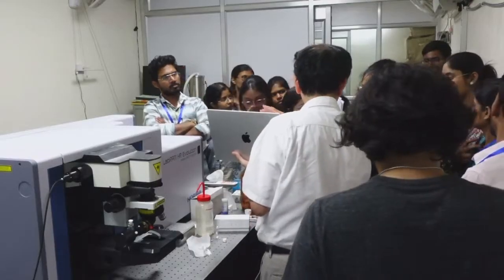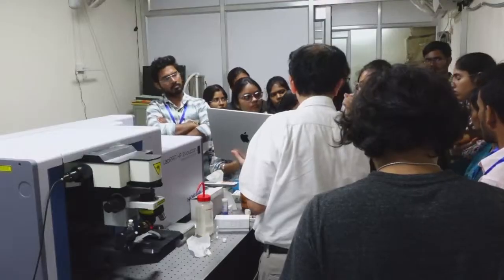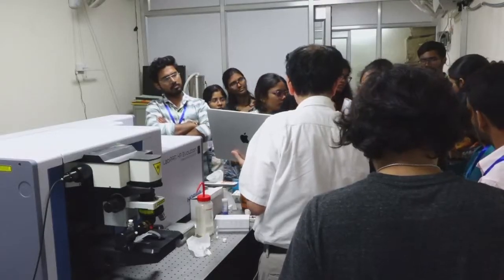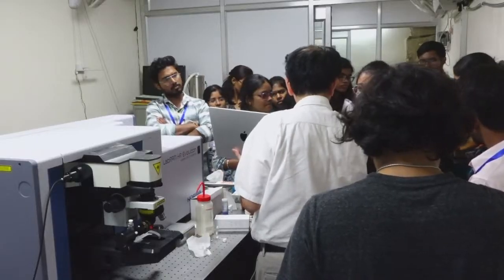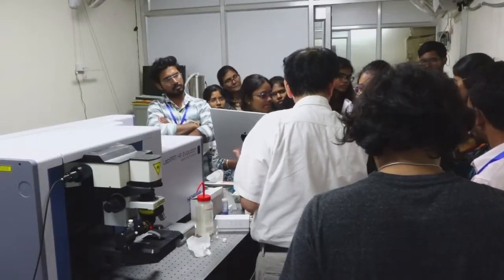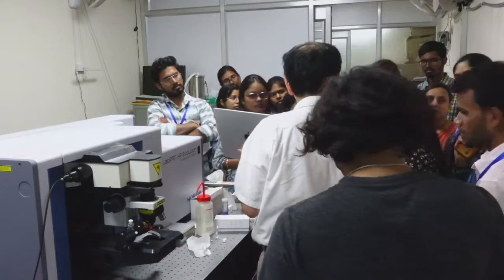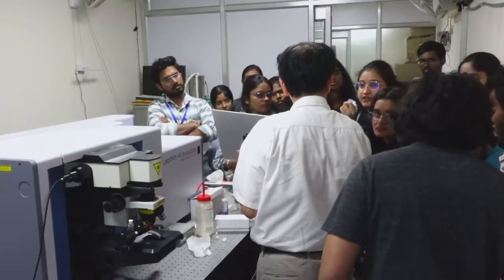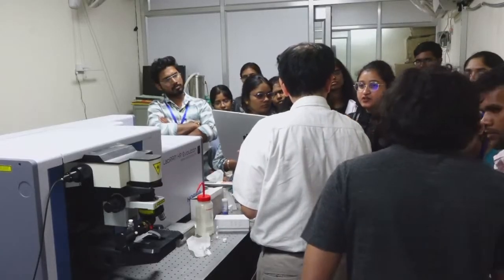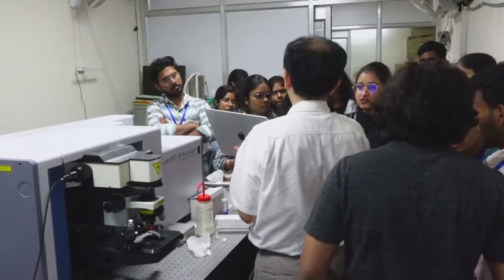Sir, if we increase the accumulation time, it means the number of times it is recording one spectrum will be increased. So it will be difficult to analyze that data now. If we are seeing more peaks, and the accumulation number is increasing, it will be difficult when we are trying to interpret our result.